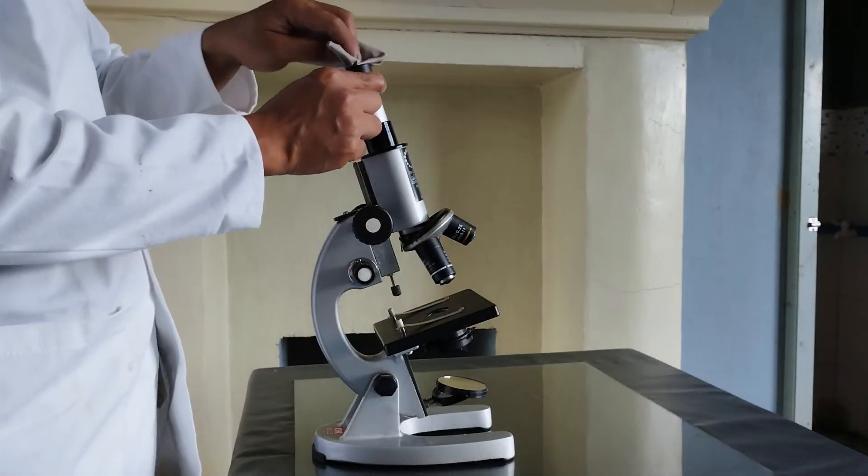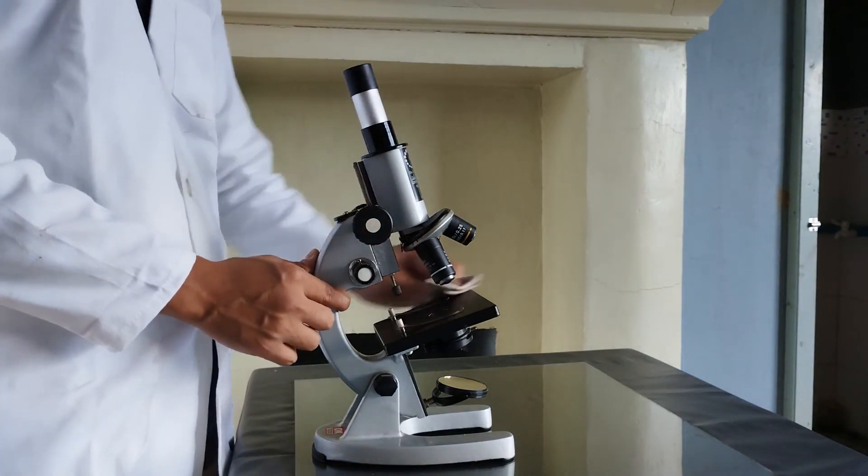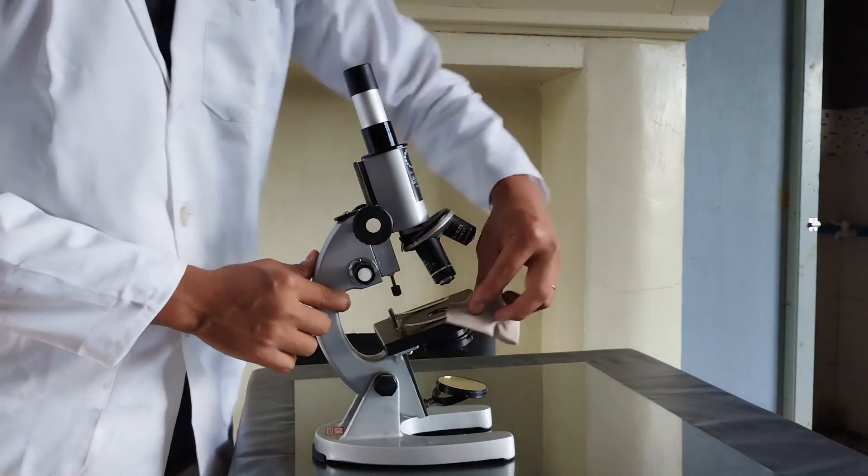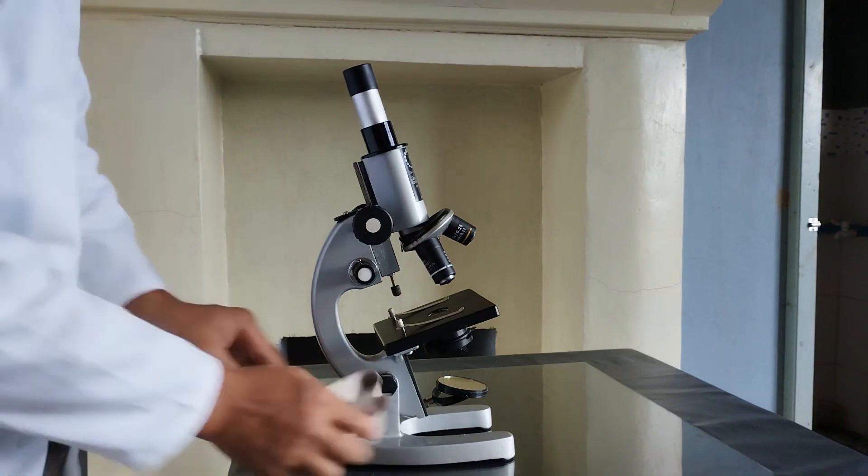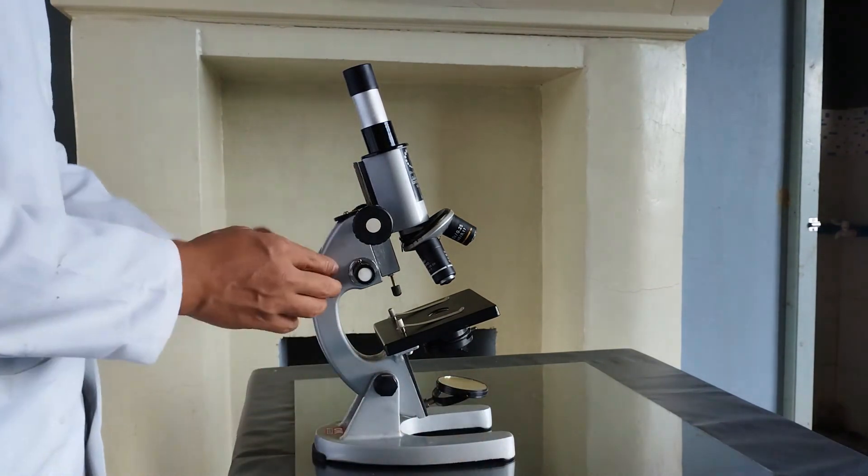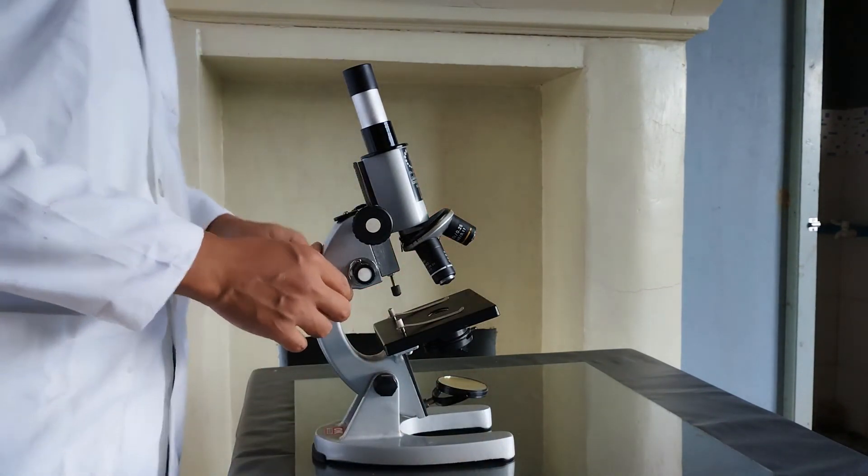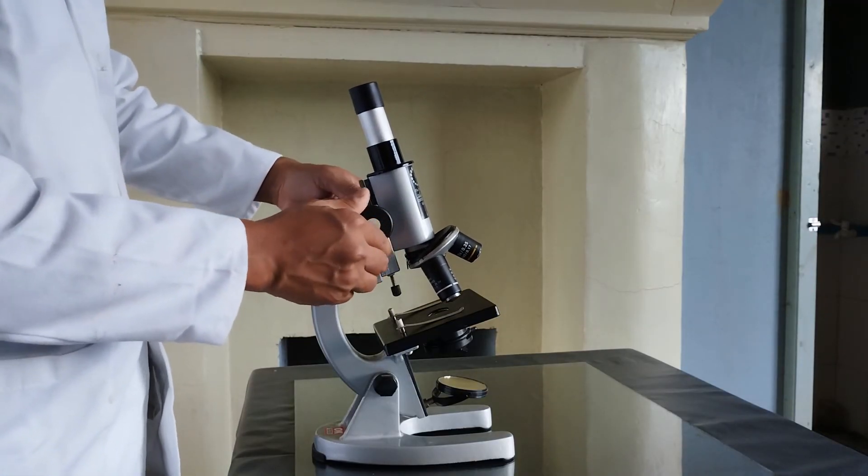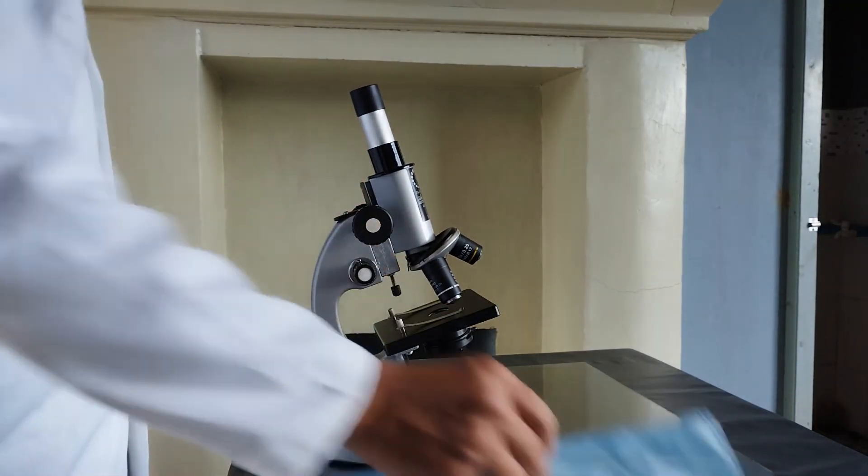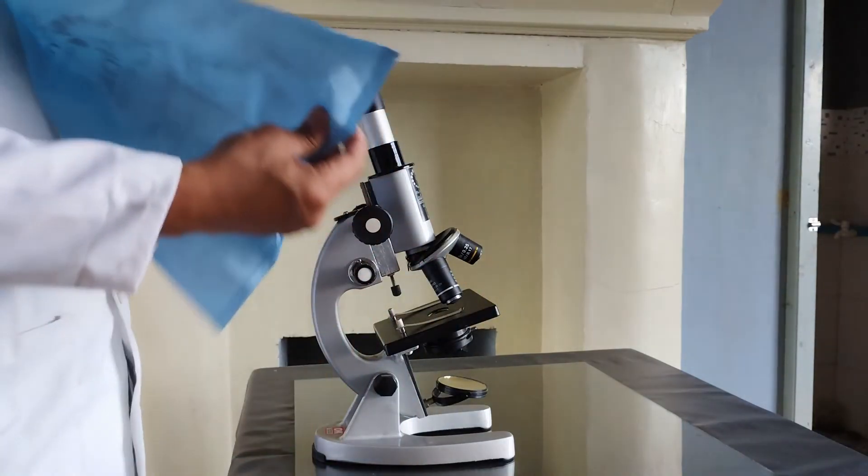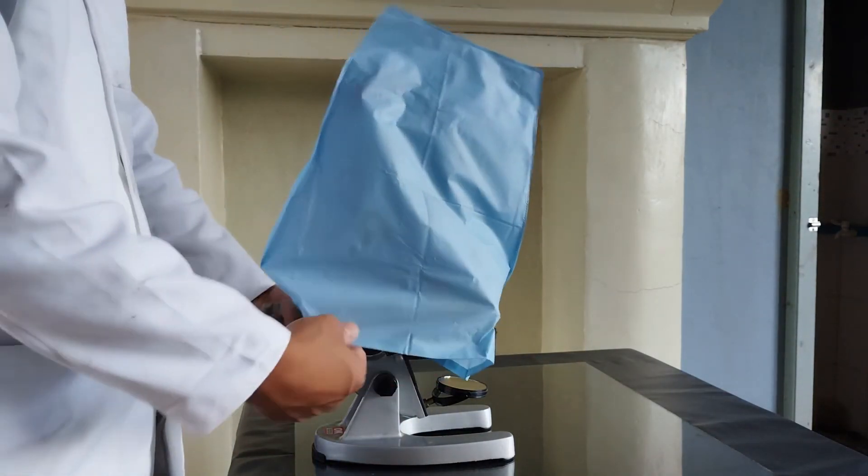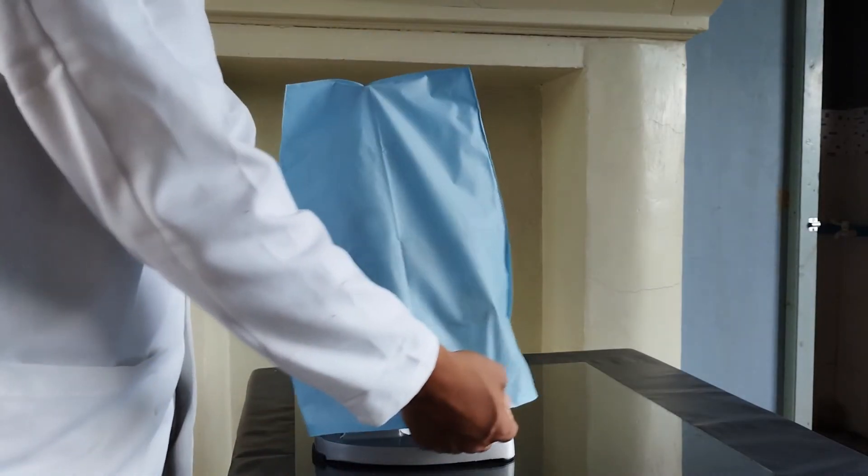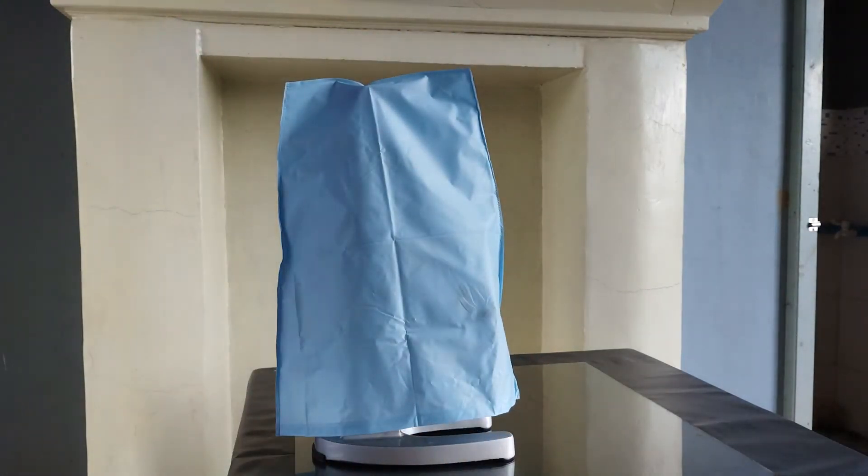Once you're finished using the microscope, clean the lenses, the stage and the body with lens cloth. Lower the body tube to minimum and keep the nose piece in neutral position, that is, without clicking any objective in position in alignment with the body tube. Finally, either cover it with a microscope cover or put it back into its designated box.